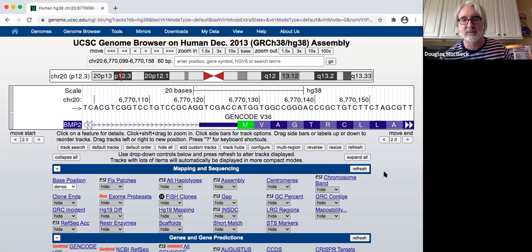You can zoom in and out, inspect things at different levels according to the kind of information that can be displayed easily at those different levels of magnification. So there's a few other things to quickly notice here. Sorry, just have to close that door, keep the noise quiet.